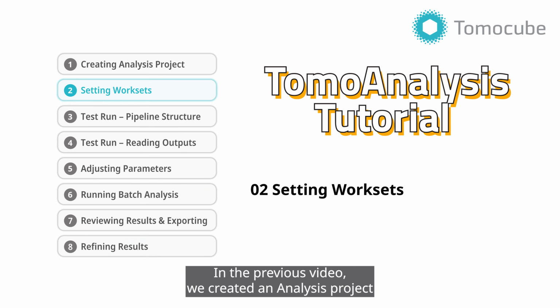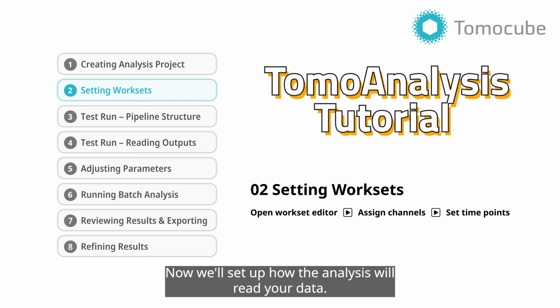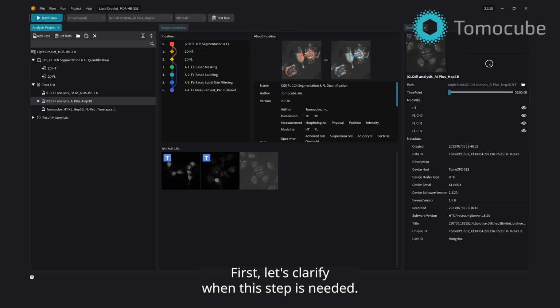In the previous video, we created an analysis project and added TCF files. Now we'll set up how the analysis will read your data. First, let's clarify when this step is needed.